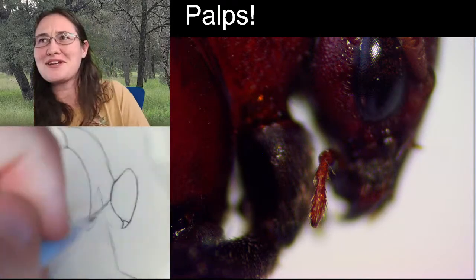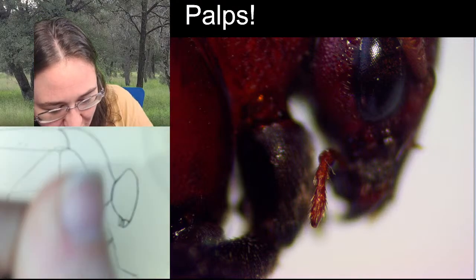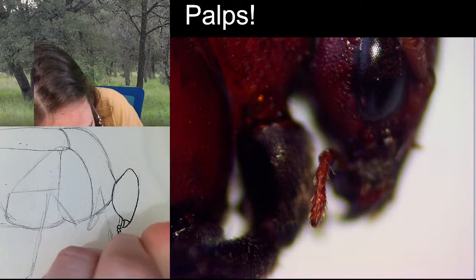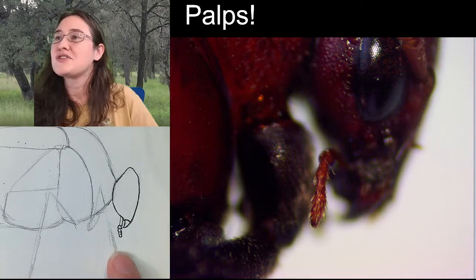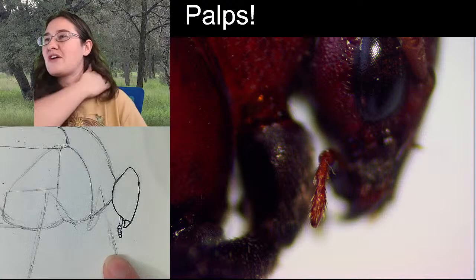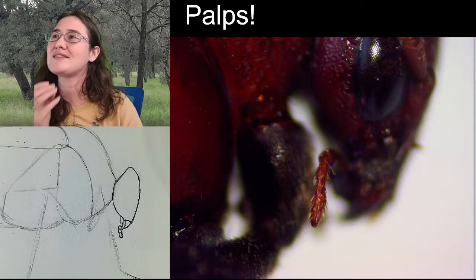Those are actually pretty long. Normally you see kind of 3 or 4 segmented palps. And the first one is really long, and then you've got these little ones. 1, 2, 3, 4. So you've got these little palps, and he does have 2 on each side. One of this, and then the other labial palp, I think it's going to be smaller. We can't see them from this angle.